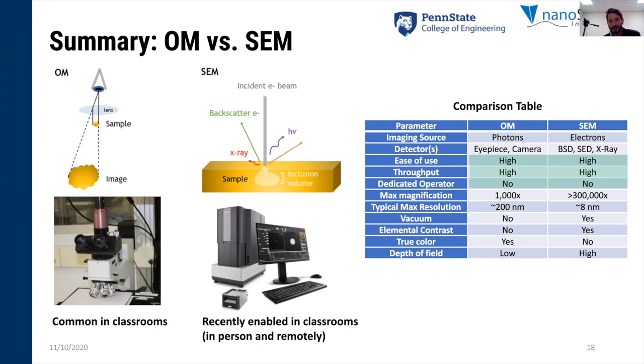On the other hand, they have some similarities as well. They're both very easy to use and they don't require a dedicated operator. So if you have an SEM in your lab, you don't need to hire a special person to work on it. The person in purchasing that bought the SEM could use it.